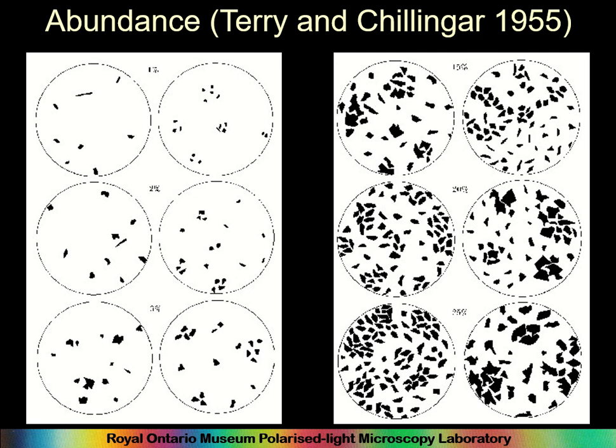The way I do it, which I learned when I worked in the geology department at the Royal Ontario Museum, is to use abundance charts. By doing this, you compare these charts to what you have, and you say, oh, that's about 1% or 2% or maybe 20%, and by this you come up with a number. How I actually did this working for my head of department back in the early-ish 80s was to use point counting.